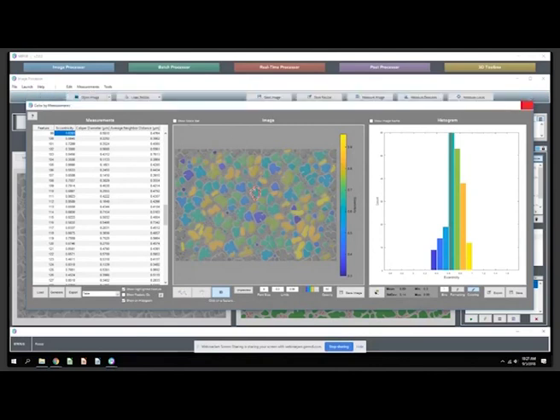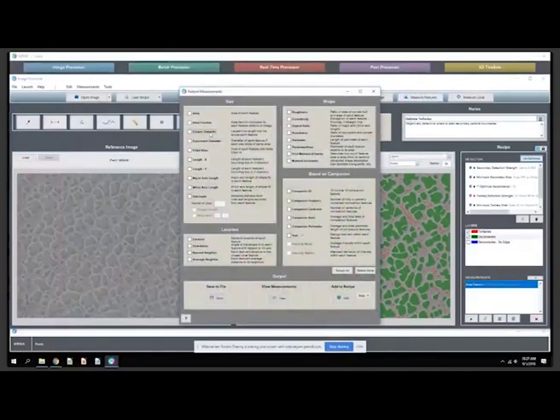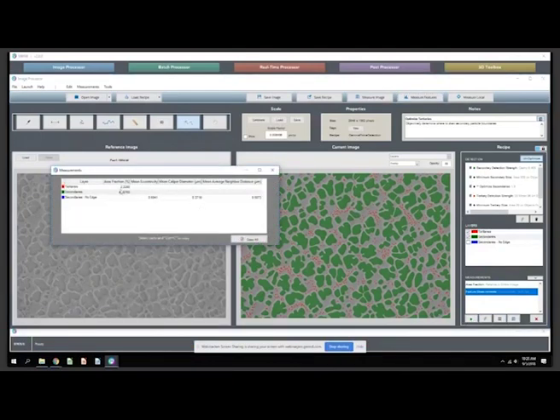Now, to finish up in this tool, let's say we go back into here and we say I want to measure the same things, caliper diameter, eccentricity, and average neighbor. You can choose what stats we want to measure from each of those in our final report. We add that to the recipe. And now when we run this whole report here, we're going to get the area fraction of those two layers, and then the mean feature measurements of this layer. So again, in one drag, you could have all of this done for your team.